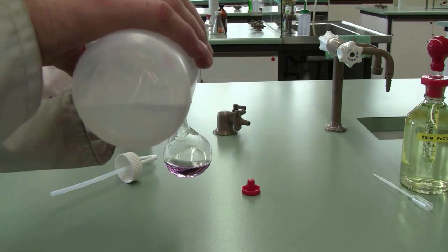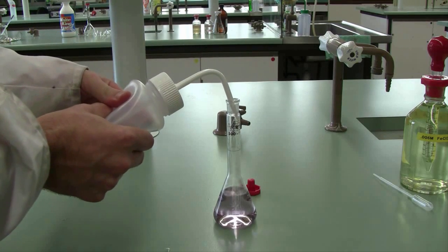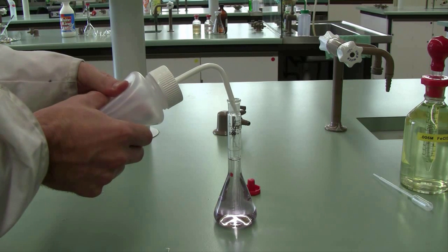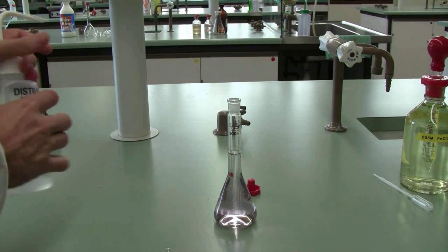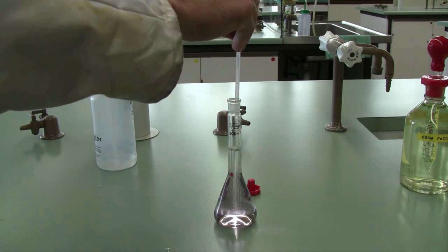Progressively add distilled water and mix as you go. Use your wash bottle when you get close to the top and use a dropper to add those last few drops to make sure the bottom of the meniscus is on top of the line. Then mix each flask by inversion, at least 40 inversions per flask.